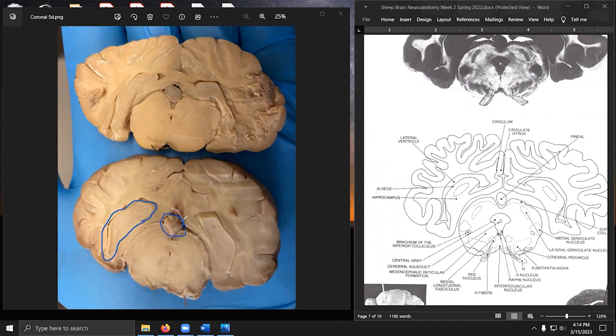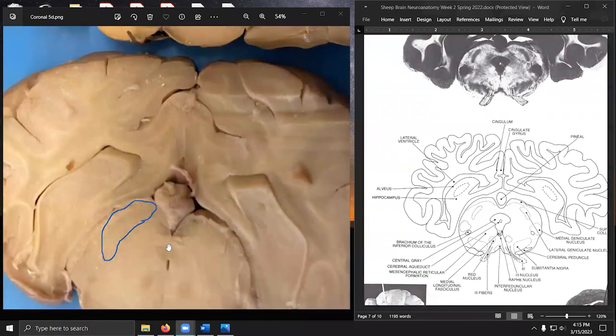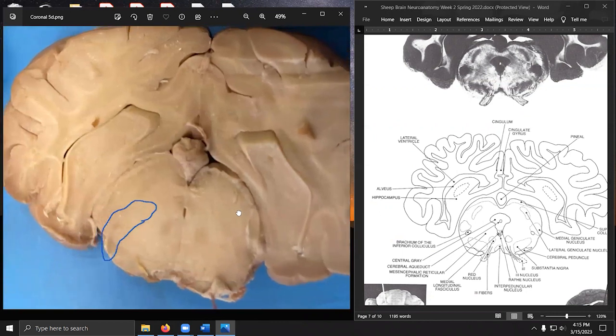Pineal gland is bulging out here. Cerebral aqueduct now is here. Posterior commissure. There's still a little bit of it there. It's a bit faint. The central gray or PAG, we can kind of see it if we look closely. So let me go ahead and zoom this in a bit. Yeah, the central gray matter would be roughly about this here. Sort of like an upside down droplet of sorts.